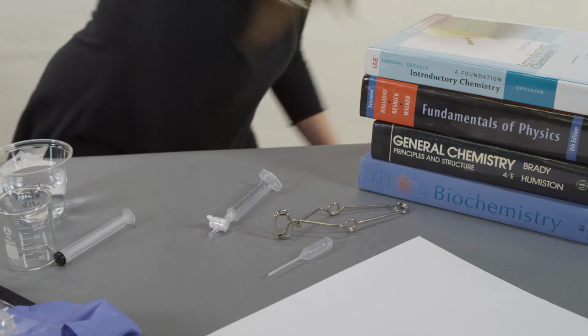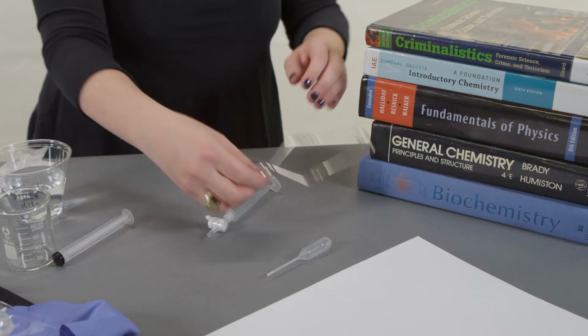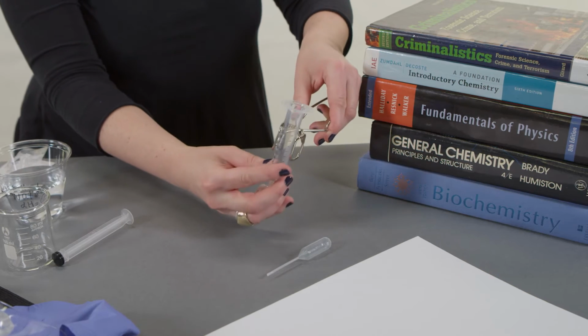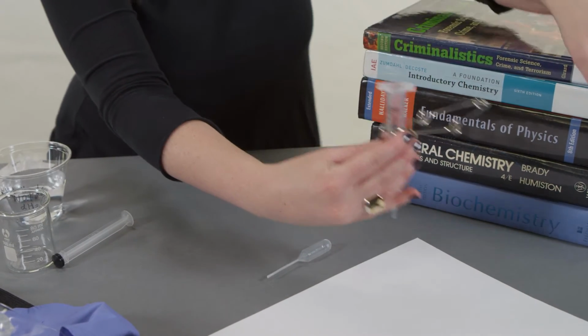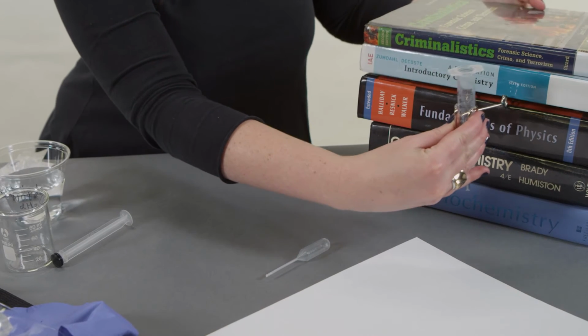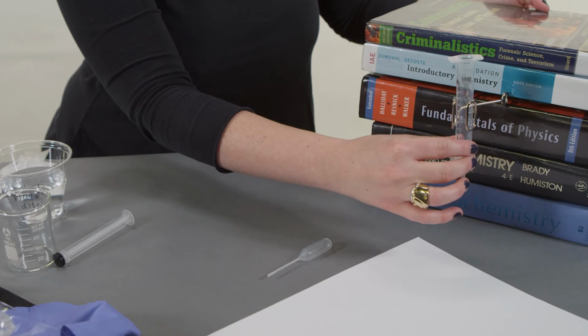Stack the textbooks on top of one another. Clamp the test tube holder around the middle of the burette and slide the long end under the top two books in a stack. Rotate the burette as necessary so that the graduations are facing outward.